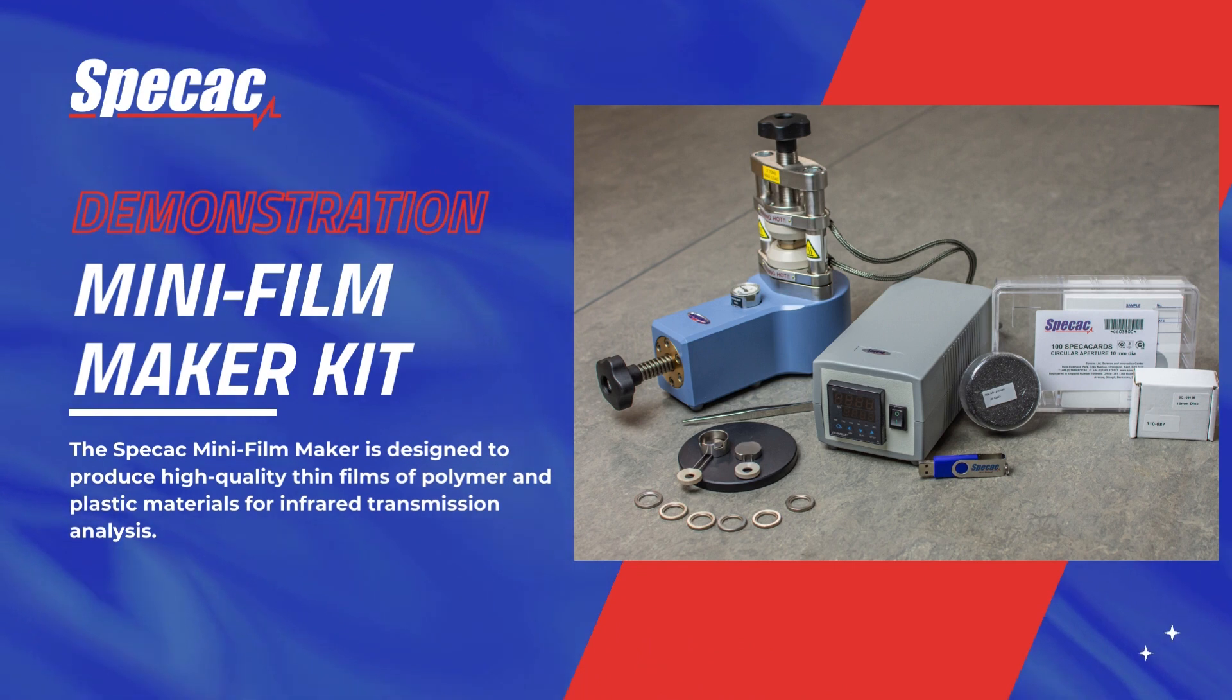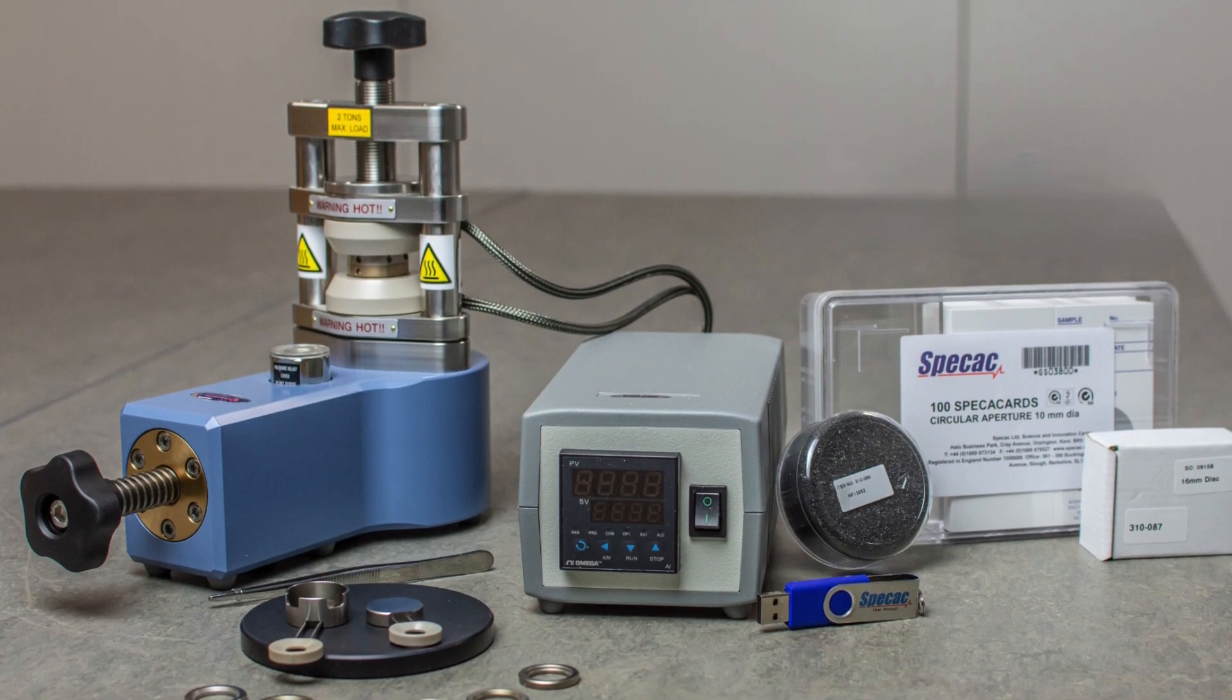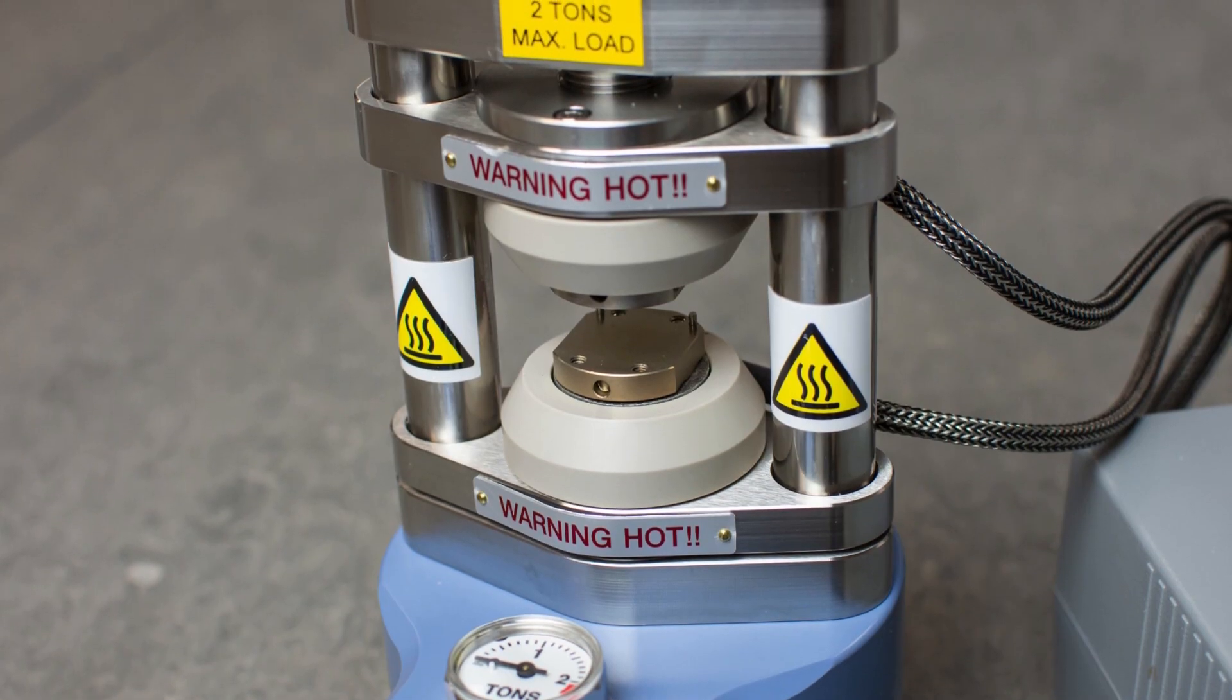The mini film maker kit is designed to produce thin films of plastic polymer materials for spectroscopy measurements quickly and easily. It consists of a mini press fitted with heated platens and a separate set of film making plates and sizing rings.